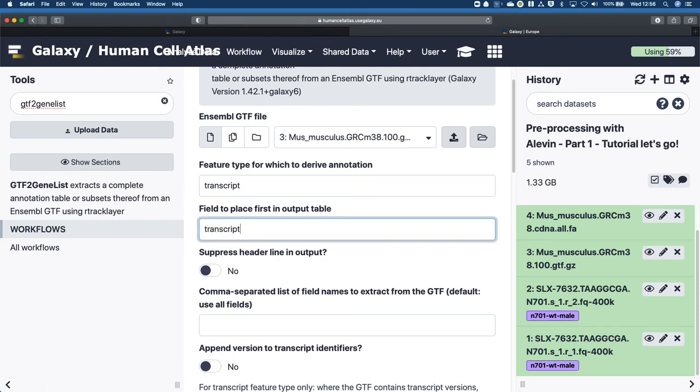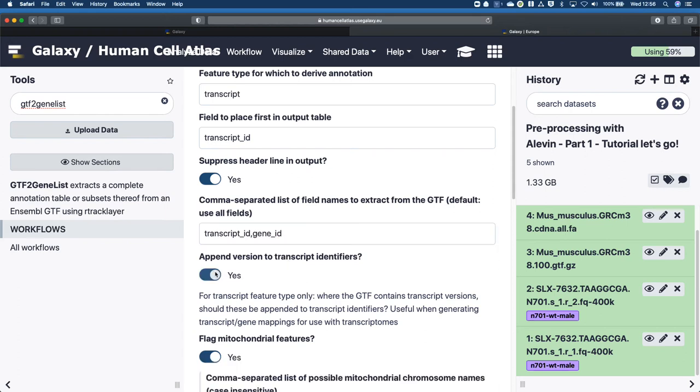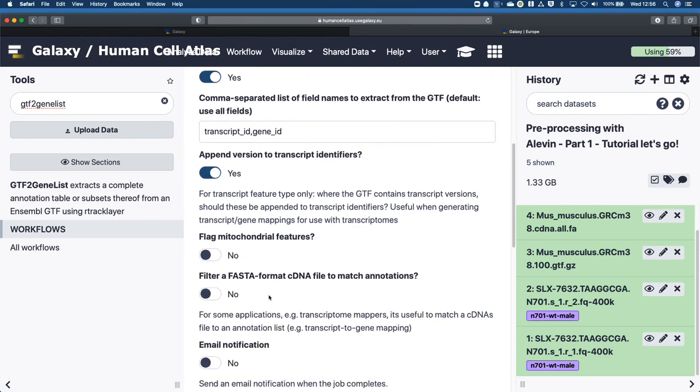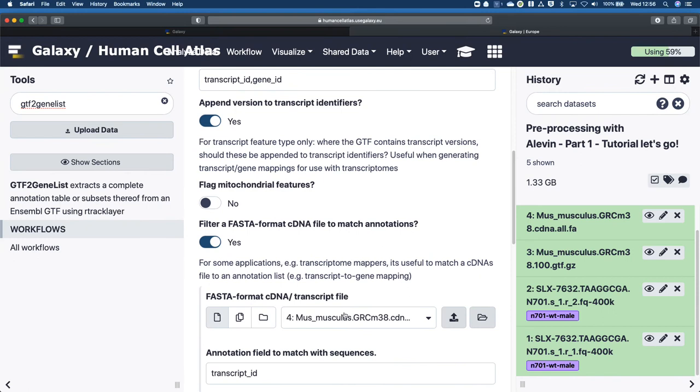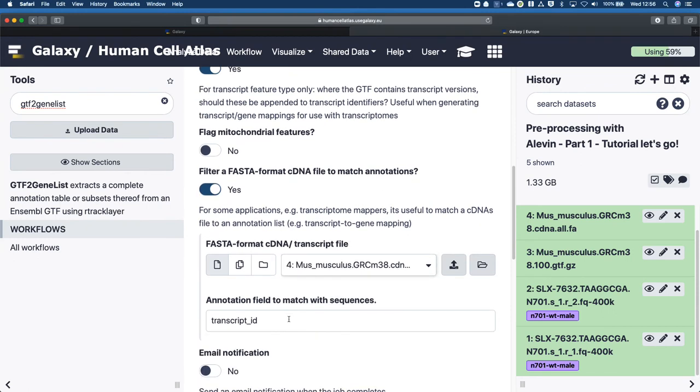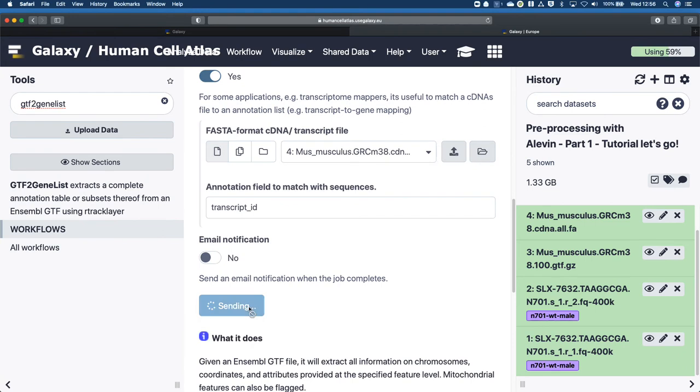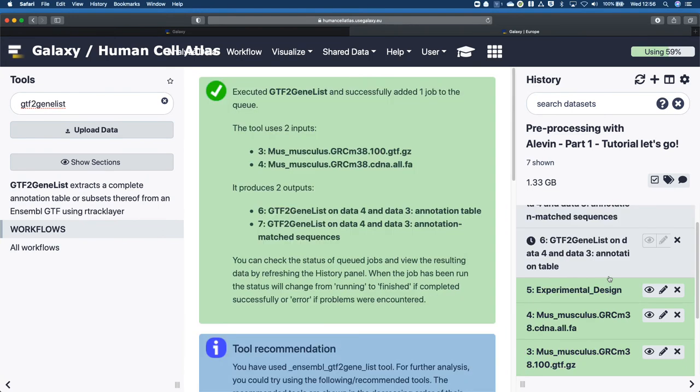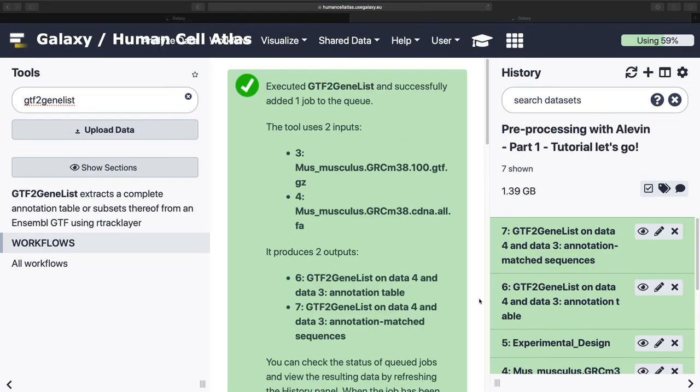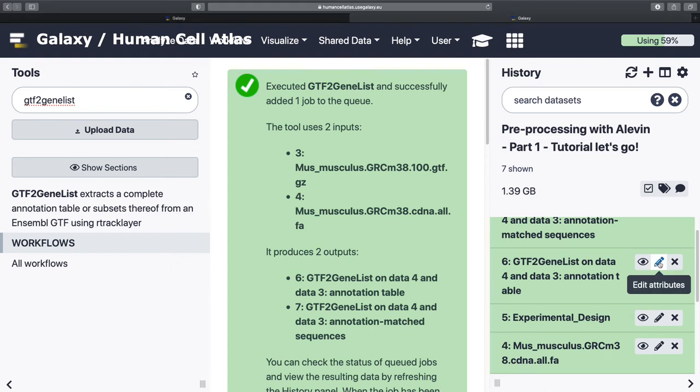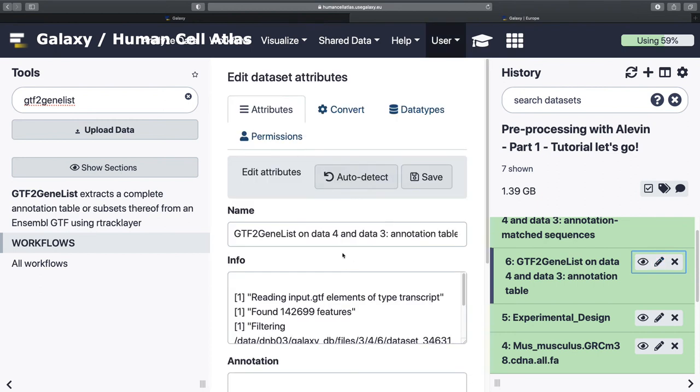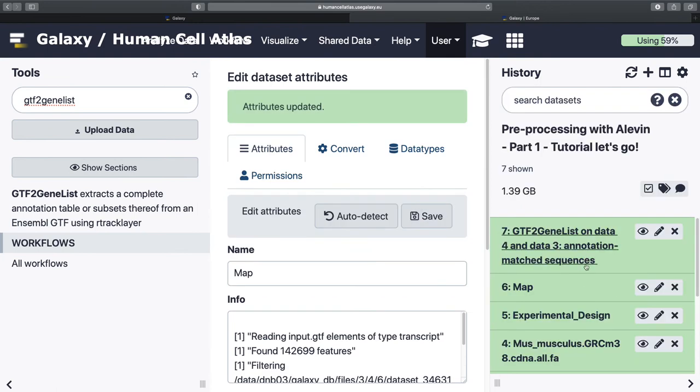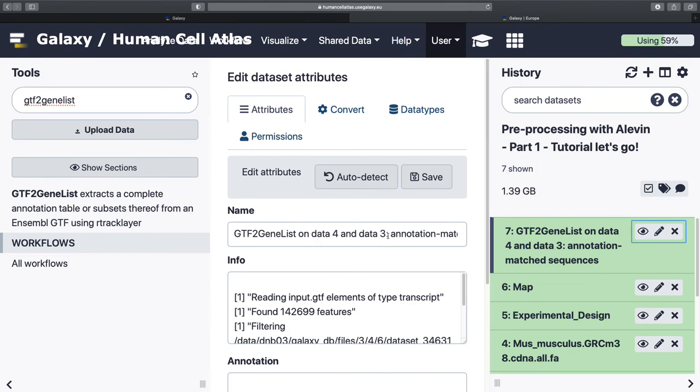And at this point, I'm copying over what's in the tutorial. So the header is just about making it format properly so that the tools will talk to each other. We're not going to flag mitochondrial genes yet. Don't worry. That will come up. This should automatically grab my FASTA. So I'm going to filter that. And this may take a little while. And through the magic of pre-recording, we are there. So I can change this to my map and this gz file can become filtered FASTA.